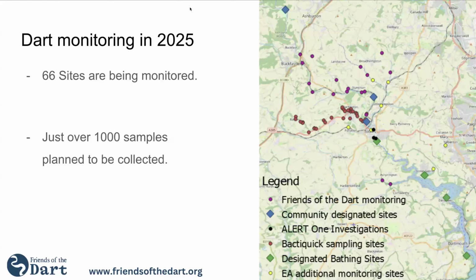Dave Hawkes, you have a hand up? Hi, hello. I hope you can hear me. That was great. I really enjoyed the presentation, and well done to everybody. I know lots of hard work went into that, and the investigative work around Kilbury Brook was really interesting. So, a quick question about Petrifilm. How quickly do you get the readout from that? Do you have to leave them to mature? Is it 24 hours and then record, or how does it work?